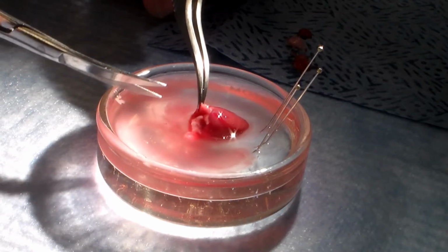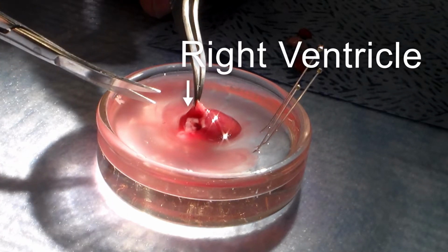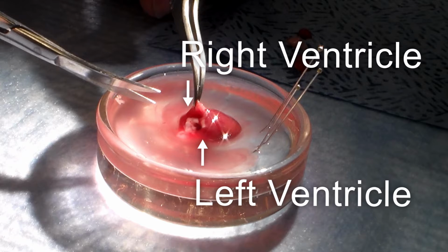What you're looking at there: once the atria have been trimmed away, the openings of the right and left ventricles can be seen at the base of the heart.